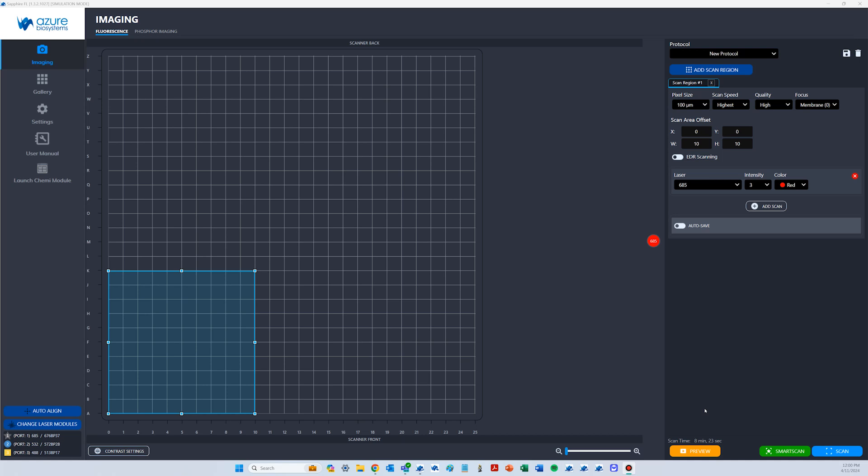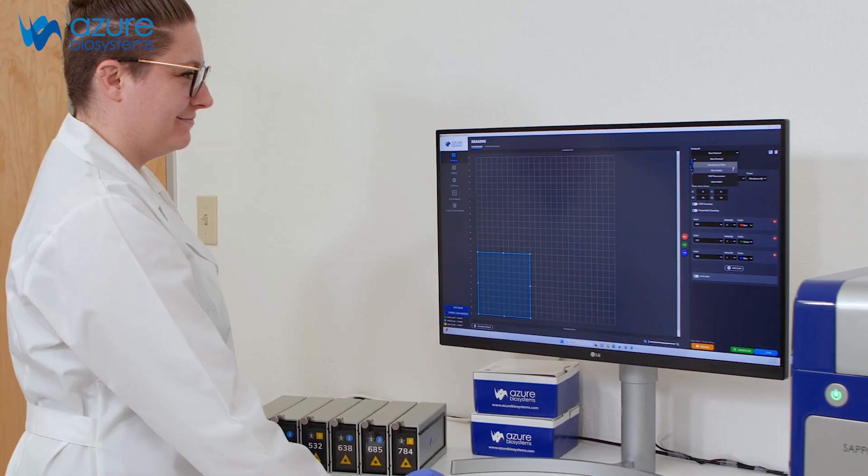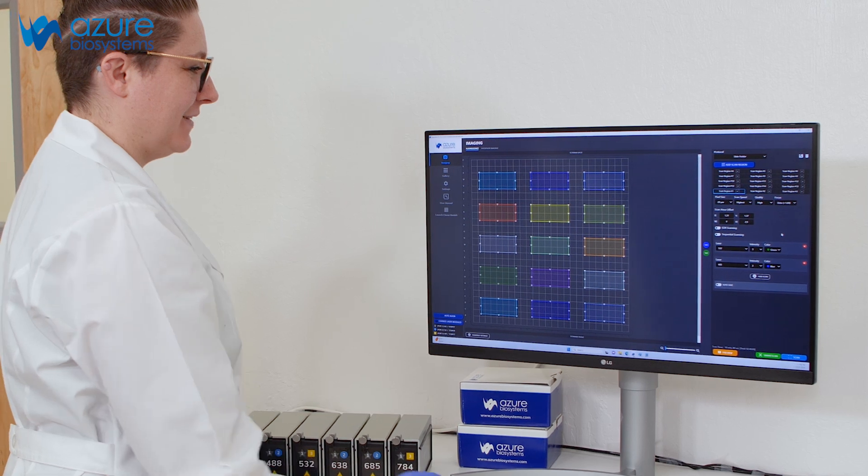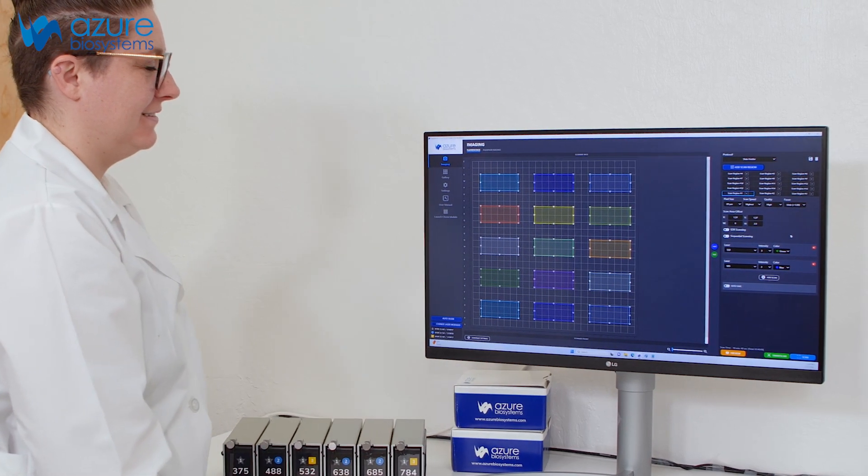Imaging parameters are set in the Sapphire FL capture software. Select from resolutions down to 5 micron and adjust the focal plane by as little as 0.01 millimeter so every sample is perfectly in focus. Select multiple scan regions for high throughput imaging and save protocols for reproducibility across experiments.